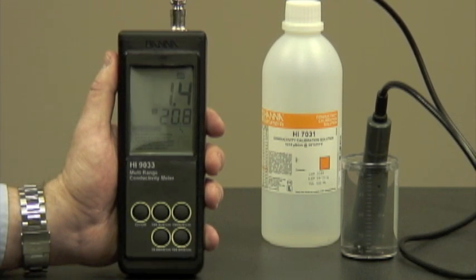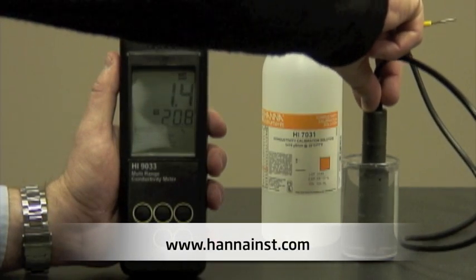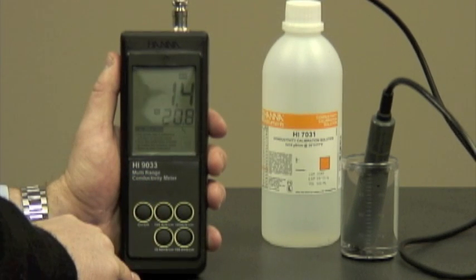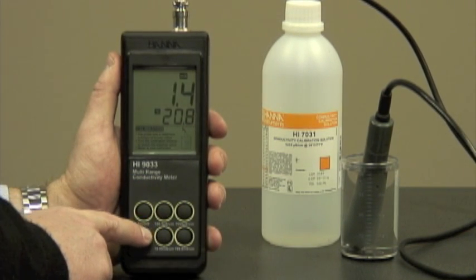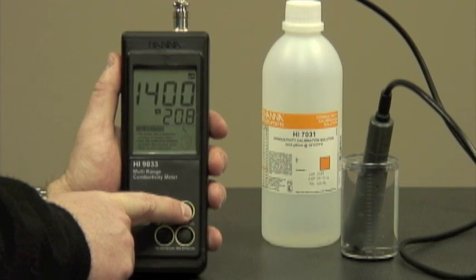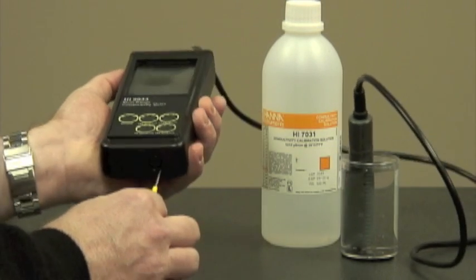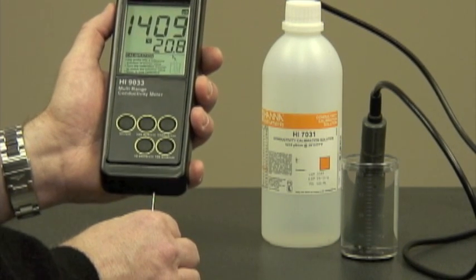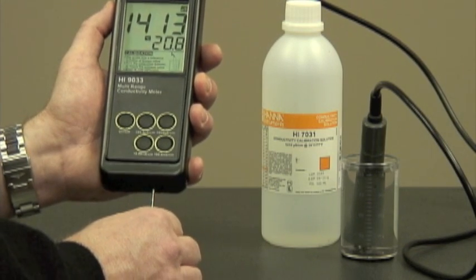We've submerged our probe all the way up to the holes. Now we're going to tap it to ensure that there are no air bubbles trapped inside. Because we're using 1413 microsiemens calibration solution, we're going to put it in the 1999 microsiemens range. Now we'll adjust the trimmer to 1413. Now we're calibrated.